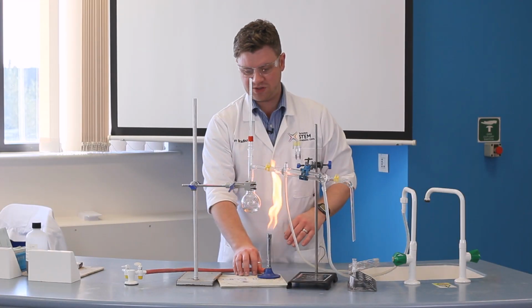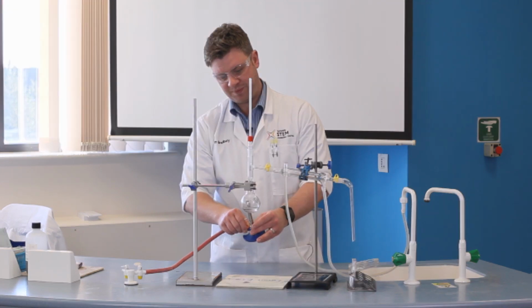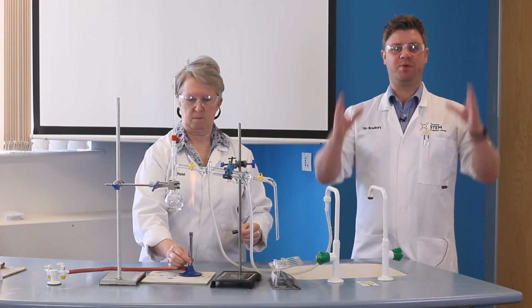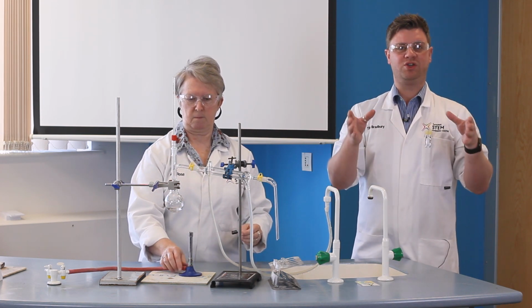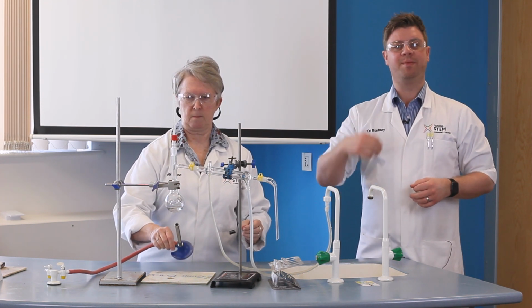In this demonstration of the fractional distillation of crude oil, we shall discuss two video clips. In the first, the teacher is conducting the demonstration alone, managing all roles in the classroom. The second shows the technician undertaking the practical procedure, while the teacher stands to one side and discusses the science behind the demo and manages the behaviour of the group.